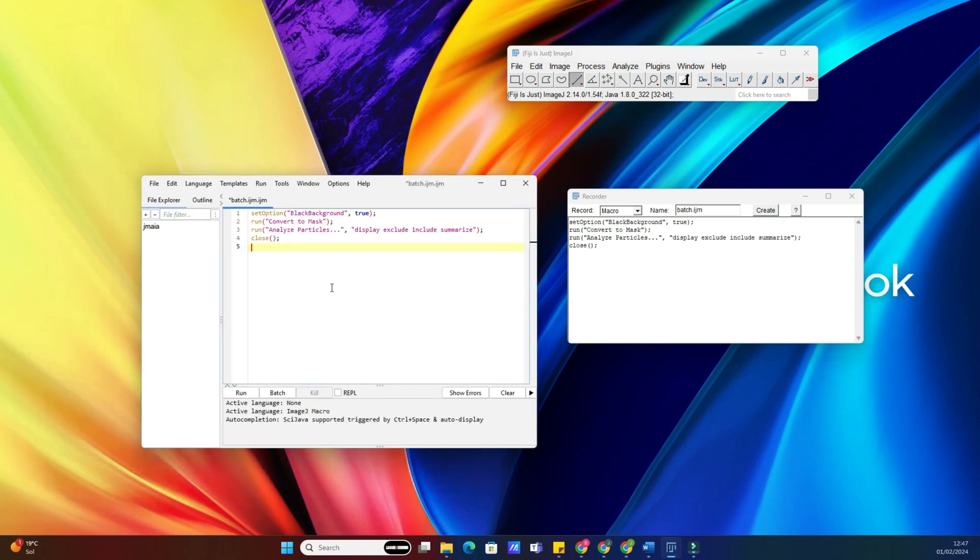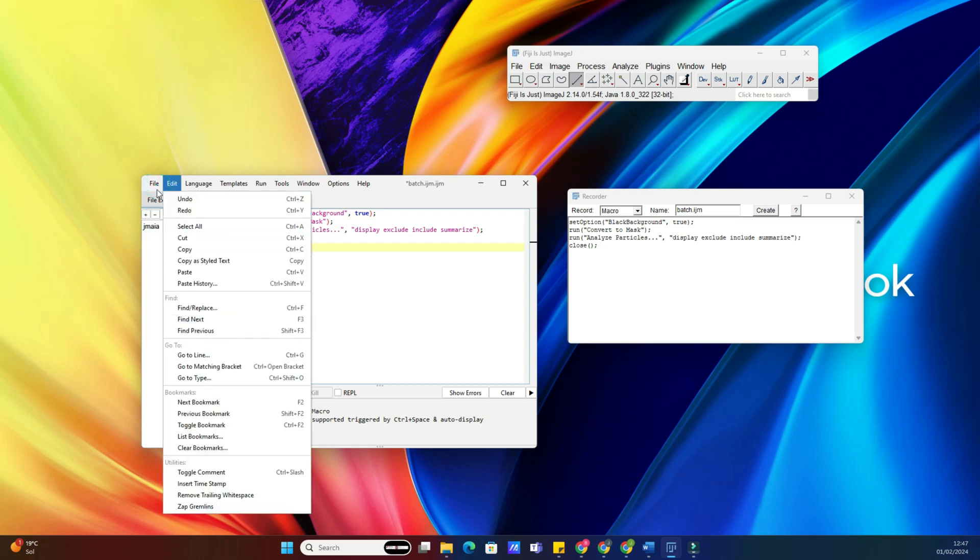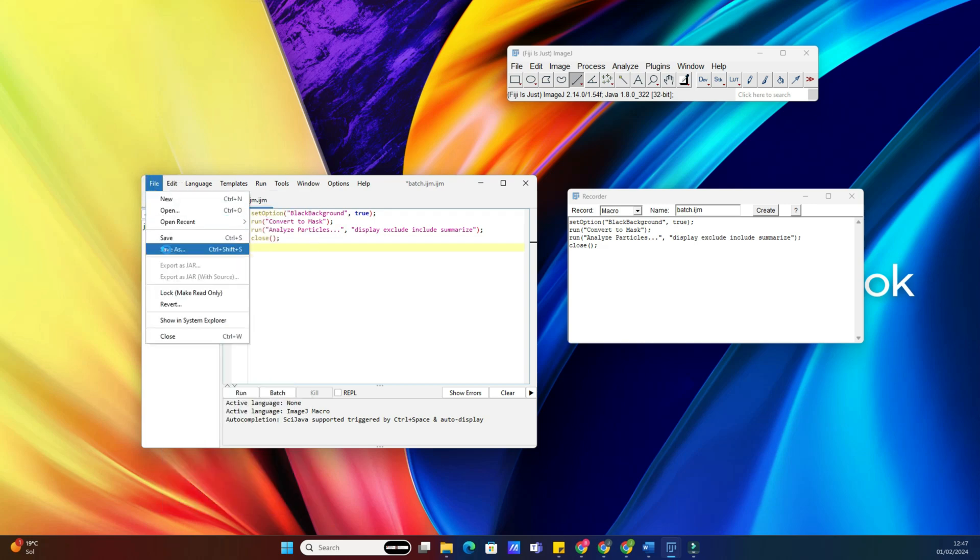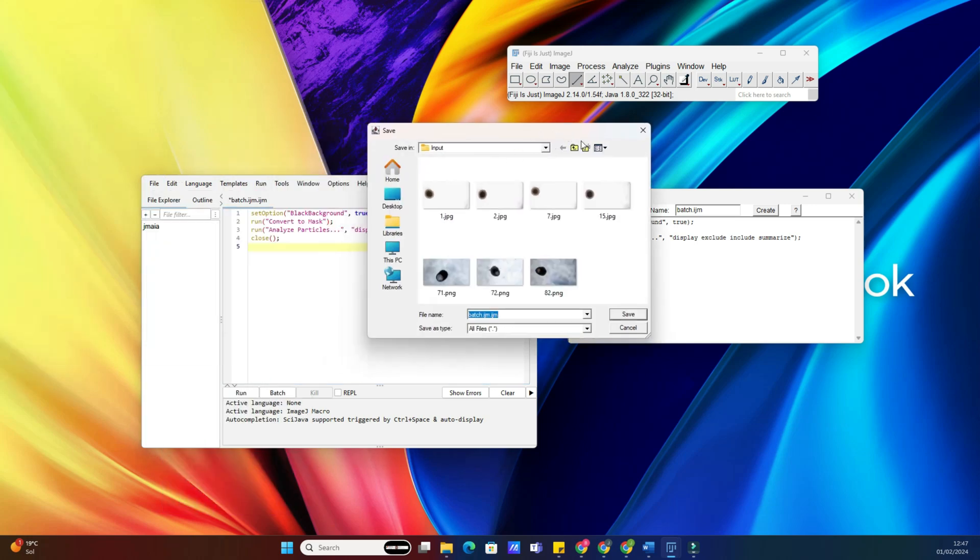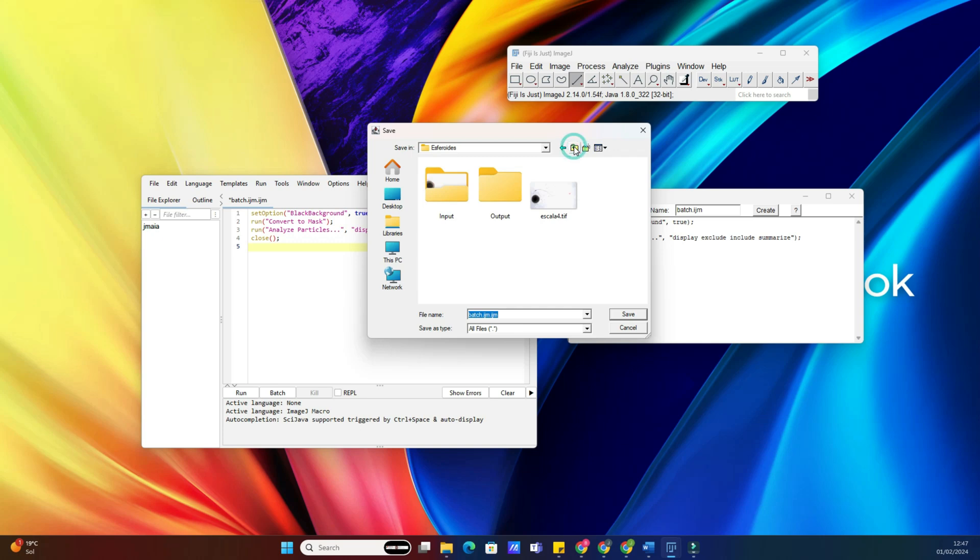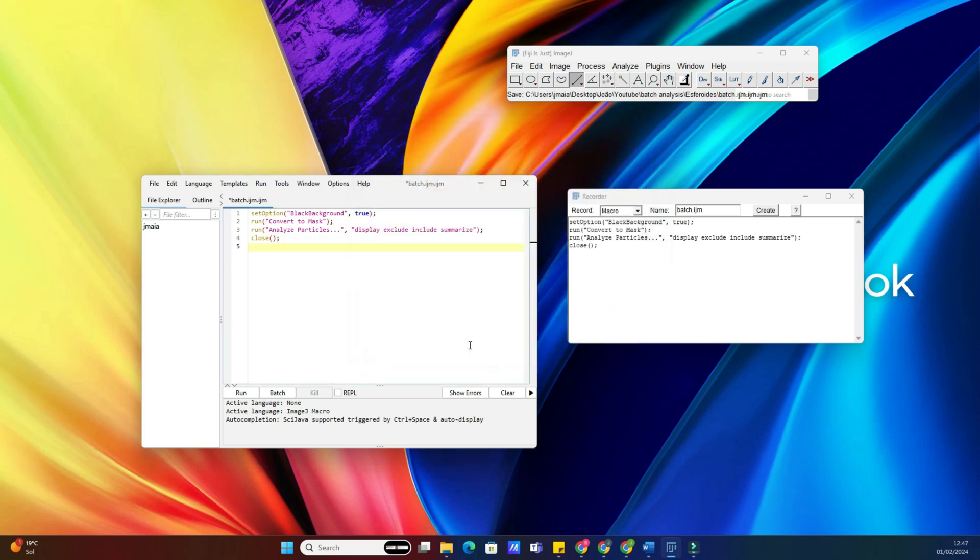ImageJ will apply your analysis to every image in the folder. Just select the directory that contains the images and the output one. Also, paste the macro in the text box and then process it.